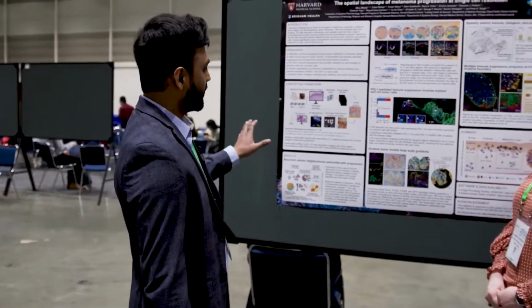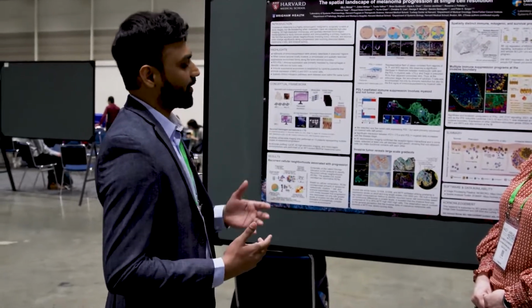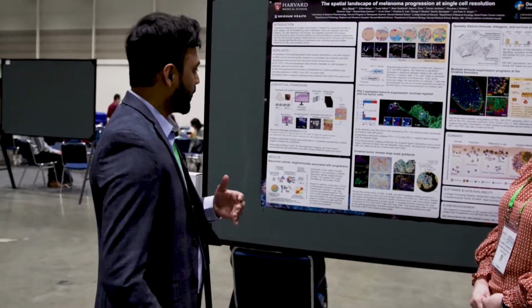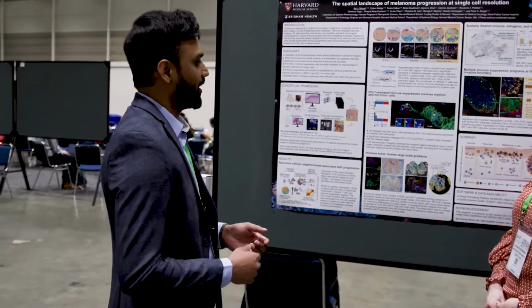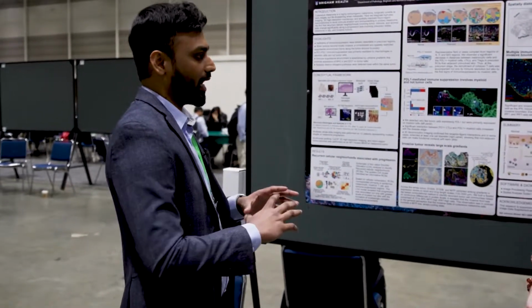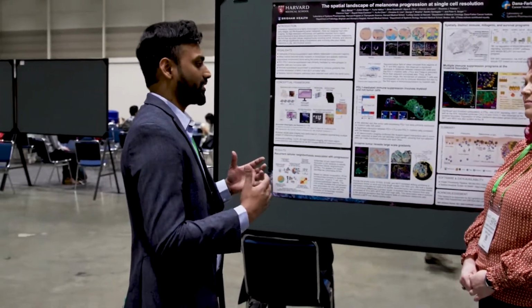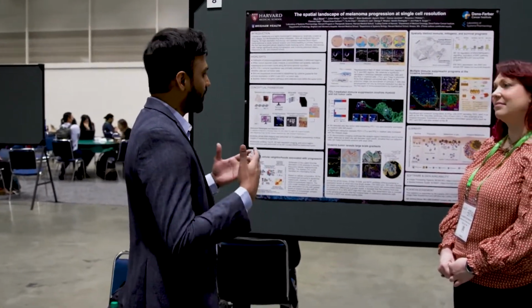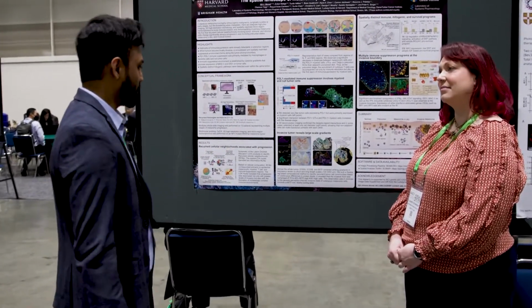We combined multiplex imaging data, a method developed in the Sorger lab called CyCIF, with microregional transcriptomics data that includes GeoMx, and also high-resolution 3D imaging data, to build a map of what's happening in these early precursor lesions and understand the underlying biology of how cancers proliferate from normal skin to a more invasive lesion.